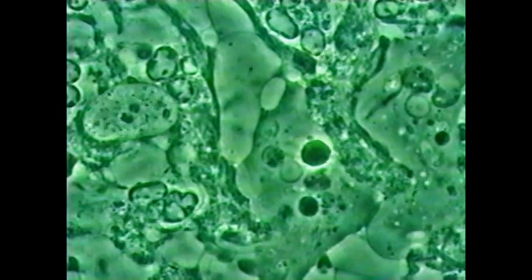Here we can clearly see Entamoeba gingivalis, the amoeba in the center, surrounded by many neutrophil white cells. Here again, red cells on top, and we see a little line on the amoeba that probably phagocytized some of those red cells. Again, another amoeba with the pseudopod. We can see a little bit of the nucleus, and many features inside the amoeba are part of nucleus ingested from the white cell.